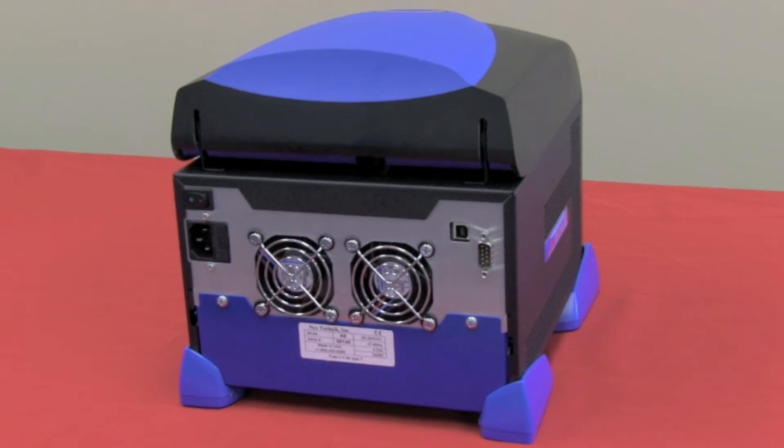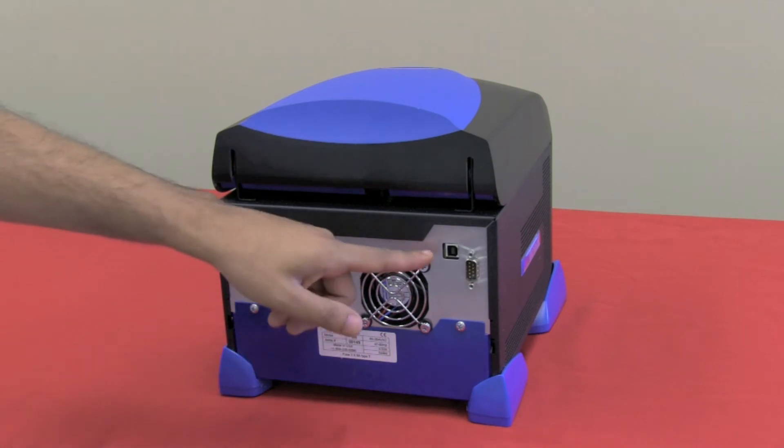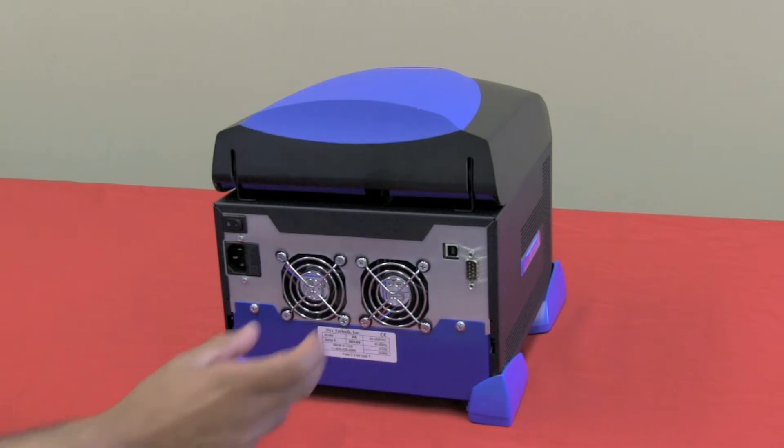This is the view we have from the back of the Amplitronics unit. You can see that we have the power switch located just here. The power input here accepts everything from 85 volts to 264 volts at a frequency of 47 hertz all the way through to 63 hertz. You can see also that there's a port for USB connectivity and your traditional COM port here. Finally, we've got the two fans here for cooling the device.